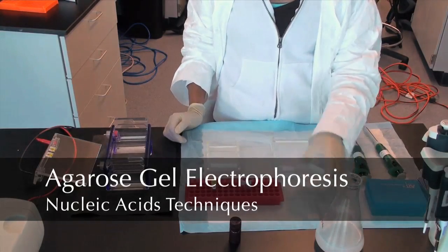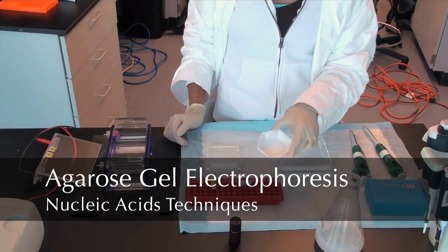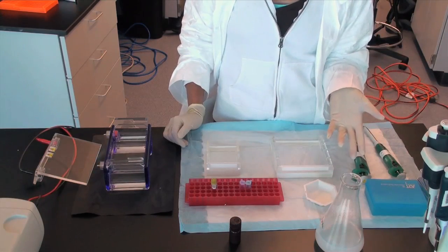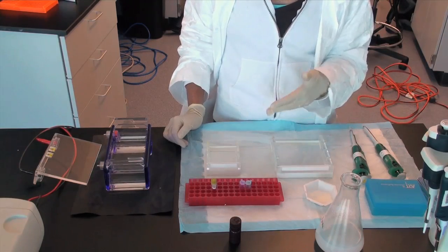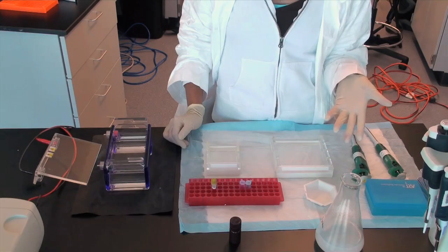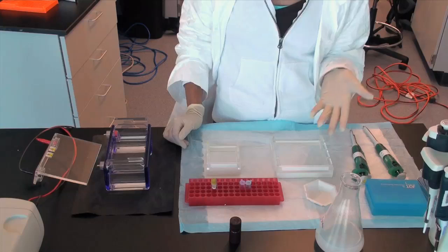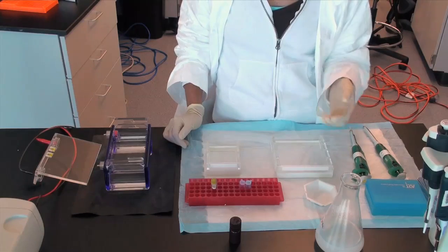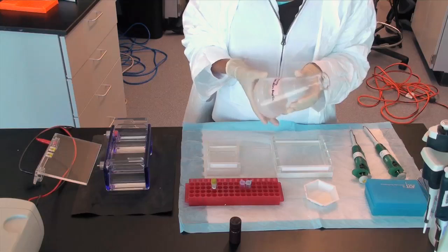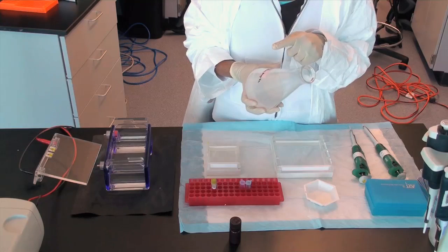Almost all agarose gels are made between 0.8% and 2%. Agarose and 0.5x TAE or 0.5x TBE buffer are the two ingredients for making an agarose gel. For example, a 1% agarose gel is made by weighing out 1 gram of agarose and 100 milliliters of TAE or TBE buffer.